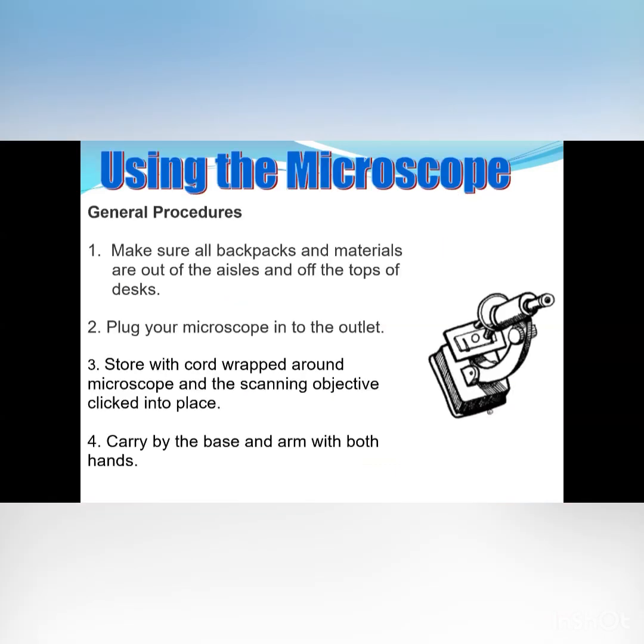As you know, a single lens can be used as a magnifying glass, which increases the apparent size of an object when it is held close to the lens. Looking through the magnifying glass at the object, we see a magnified, virtual image of the object. This type of microscope can achieve a magnification of typically up to 40 times, which is sufficient to study relatively large samples. However, achieving higher magnification and better image quality required the use of more optical elements, which led to the development of the compound microscope, which we are going to talk about in the next weeks.